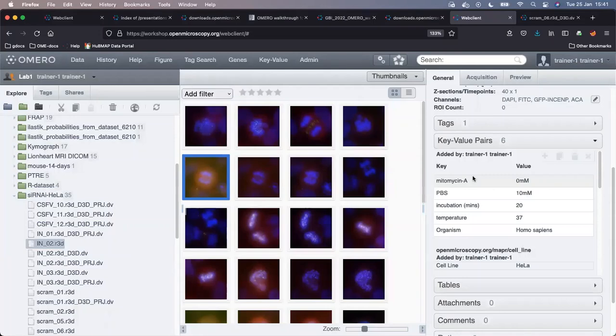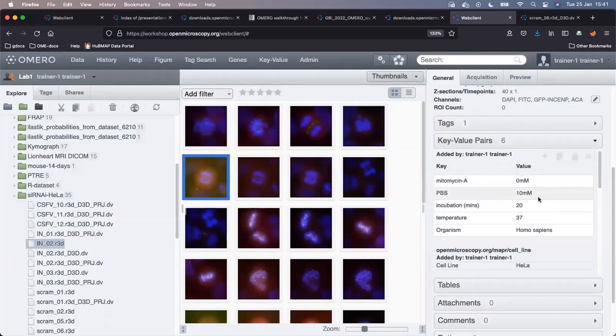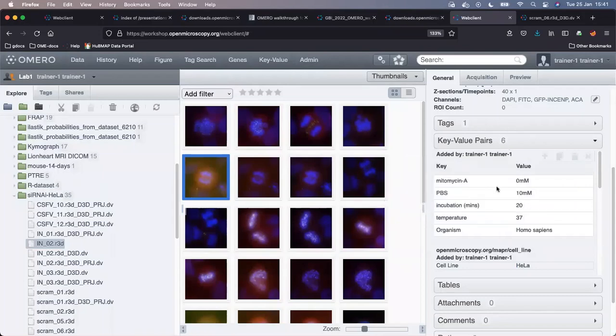This is always something which we call a key, meaning a category of quality such as temperature or secondary antibody concentration, and then the value, which denotes the number, the height of this quality. With keys and values, you can capture a lot of information in a sensible manner, which you would not be able to do with tags because you would not understand which tag belongs to which.